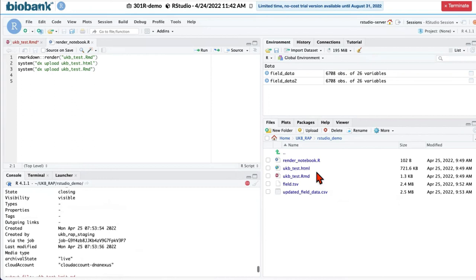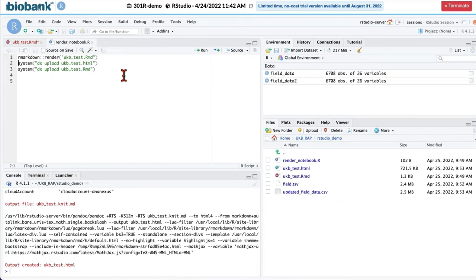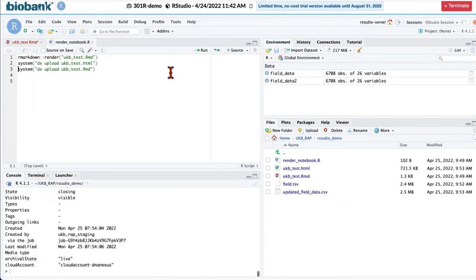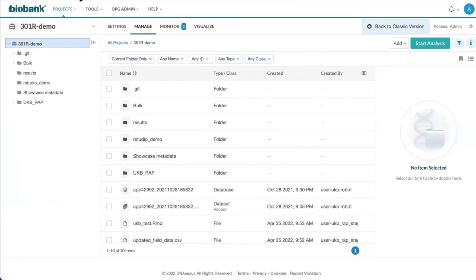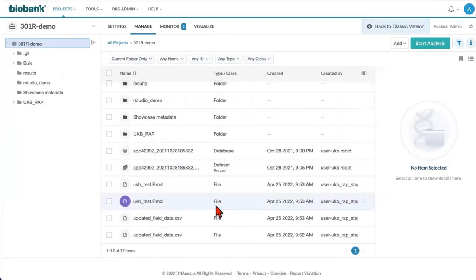Now you see that the HTML file is newly generated. We can upload it to our project. And now you can see that we have HTML file here. Here it is uploaded.